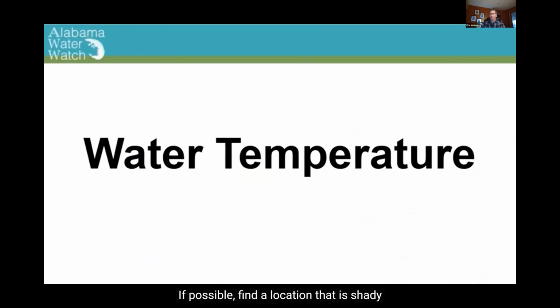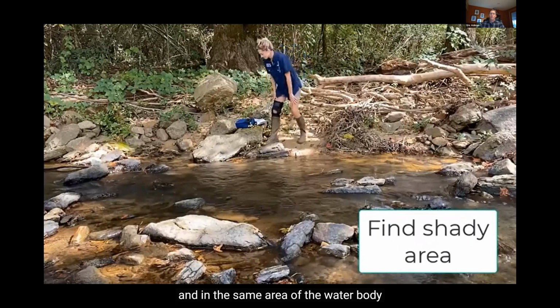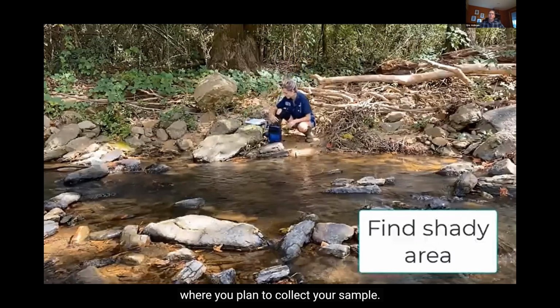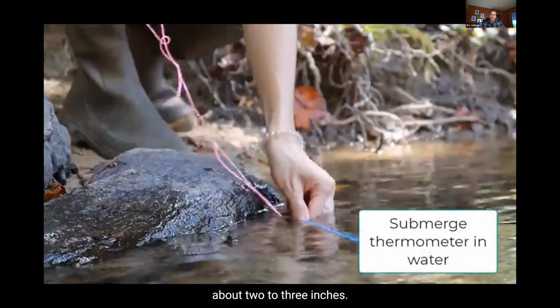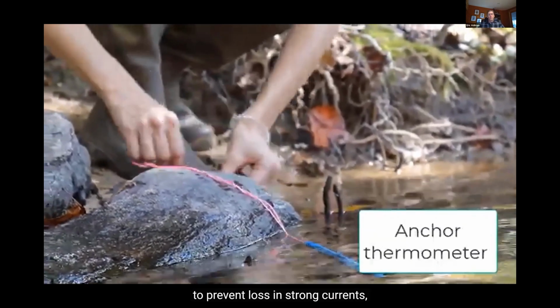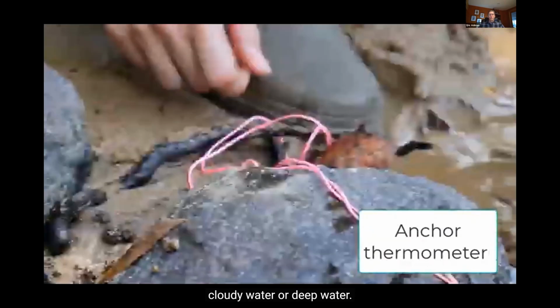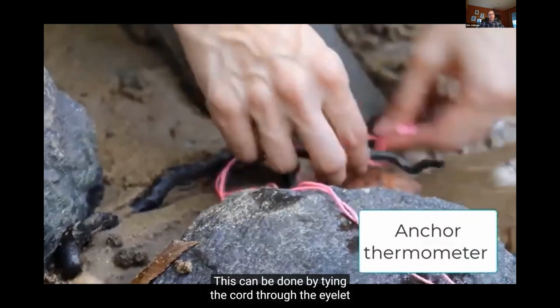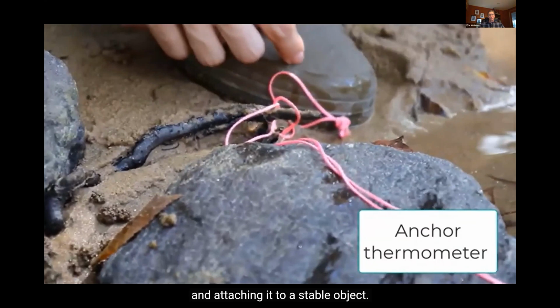If possible, find a location that is shady and in the same area of the water body where you plan to collect your sample. Submerge the thermometer in the water about 2 to 3 inches. It may be necessary to anchor the thermometer to prevent loss in strong currents, cloudy water, or deep water. This can be done by tying a cord through the eyelet and attaching it to a stable object. If no such object is present, you can hold the thermometer in place.